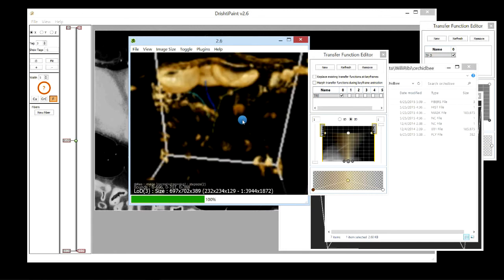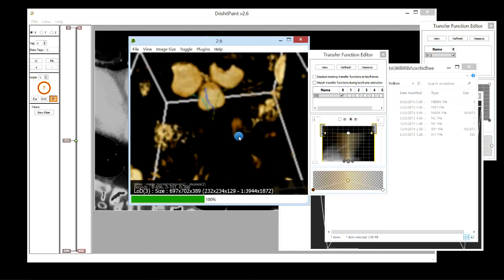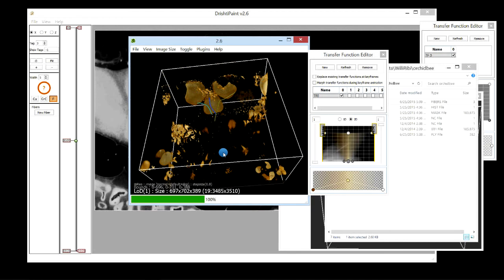options. So this is the way in which you can create or track the fibers or track the channels, and then you can load them in Drishti to see these tracks.